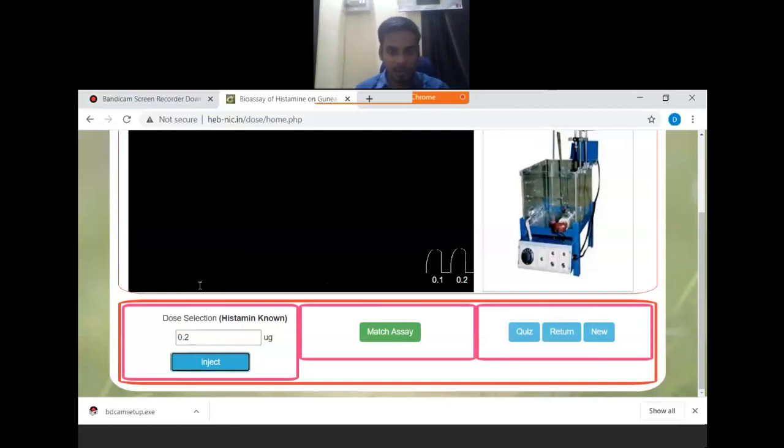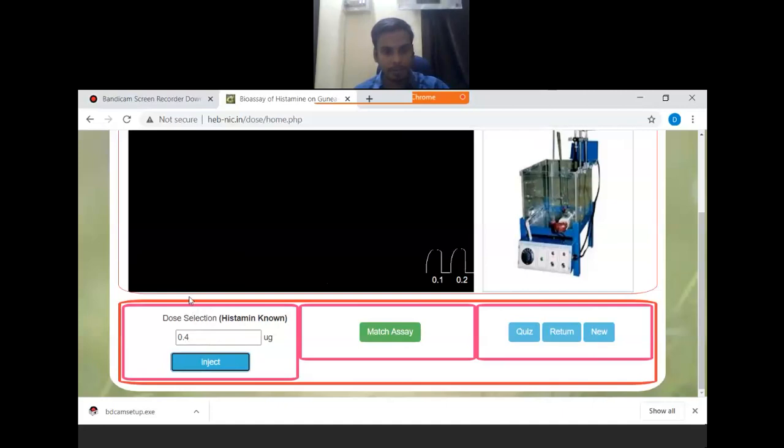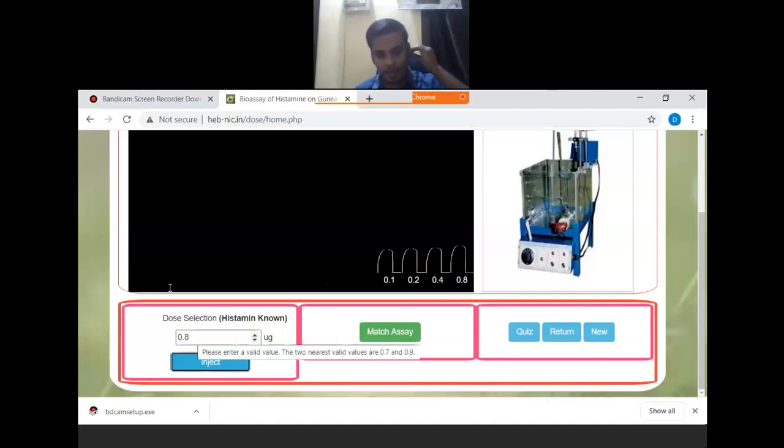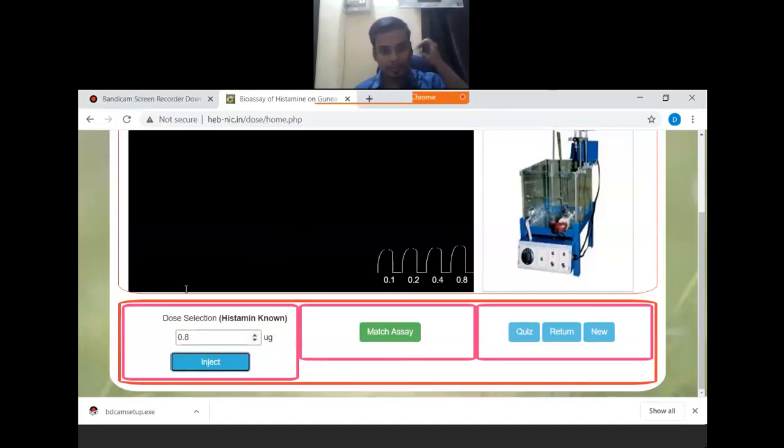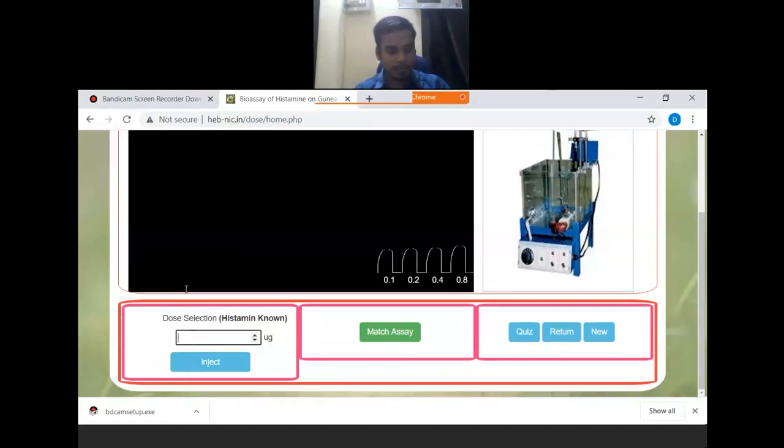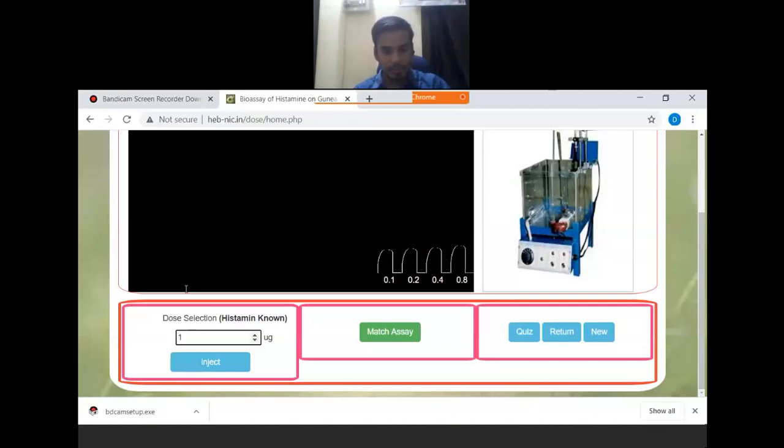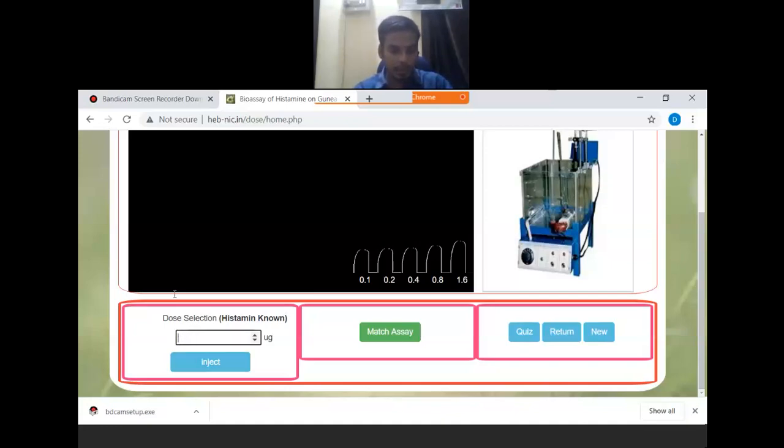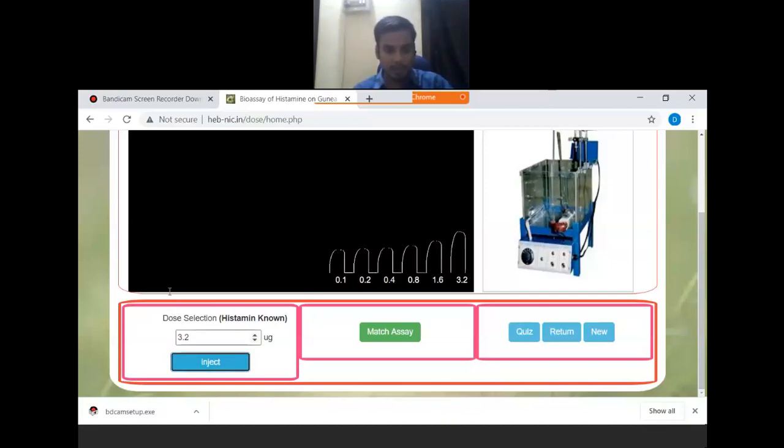After this we are getting these doses - one response will be there and then it will be 0.4, 0.8, 1.6, 3.2, and then 6.4.